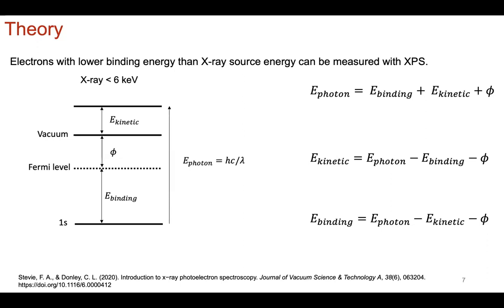Yes, because you know the work function from the Fermi level to the vacuum, that's based on the detector. So you know the work function of the detector. This is new. But isn't it also material specific? Yes, and this is all mapped out. Okay. Yeah, all of these values are mapped out.